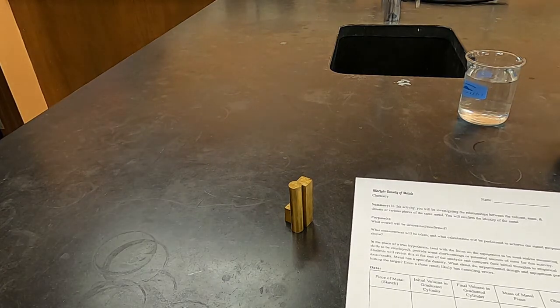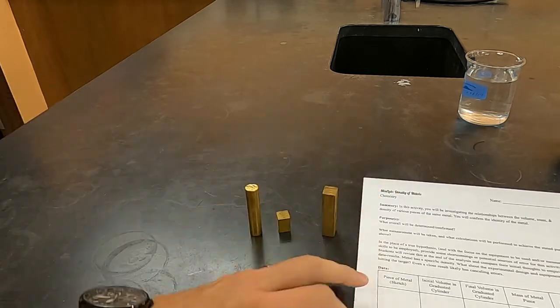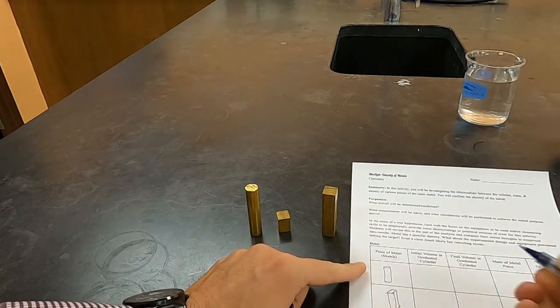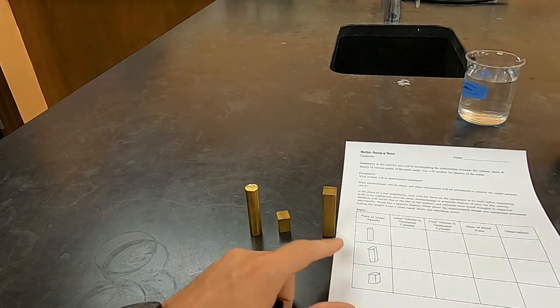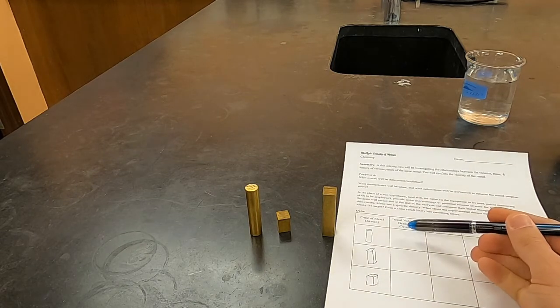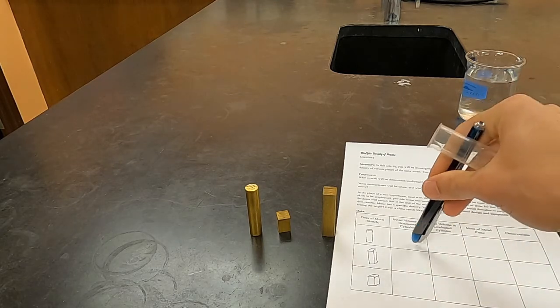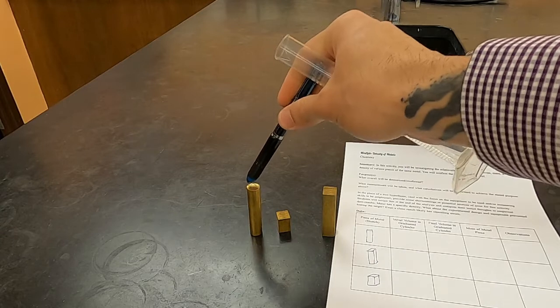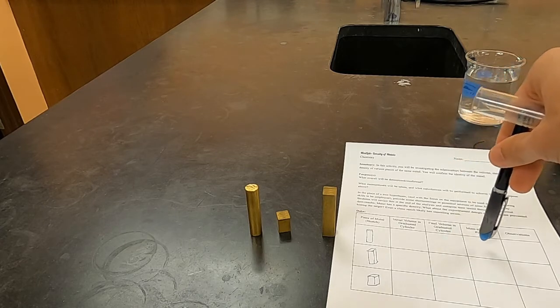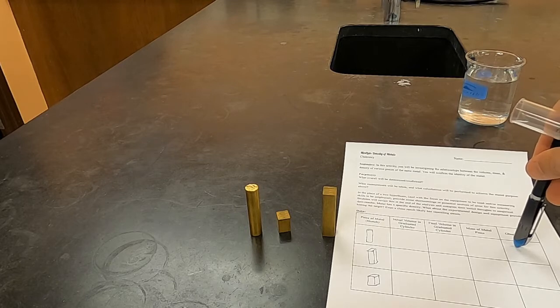Your first step, because the three pieces are not labeled, is that you're going to draw sketches of them here. We're going to be measuring their volume by water displacement. That means that for each one, we're going to have a graduated cylinder with just water, and we would mark that volume here. And then we would gently slide in the piece of metal and see how much the water level goes up by. We would then dry that piece of metal off and take its mass and make observations about its color, other properties, if it's magnetic, and things like that.